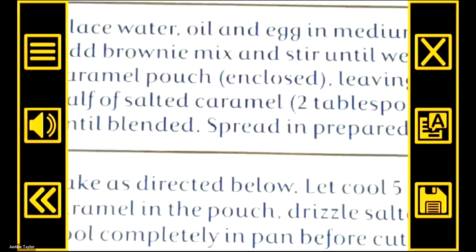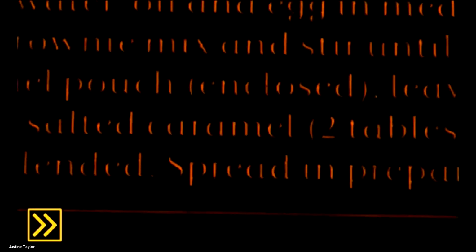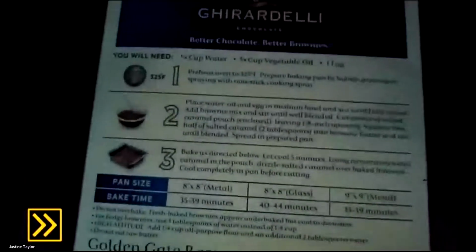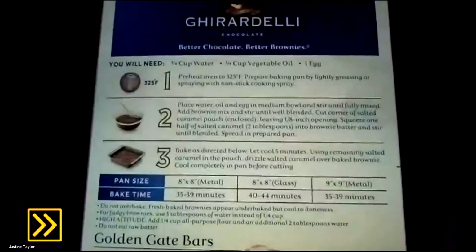And we could do the same thing. I can change my color. So my text isn't looking great. So I can just hit the capture button again. Return to live view. And I can take another picture here. Make sure it's Capture.